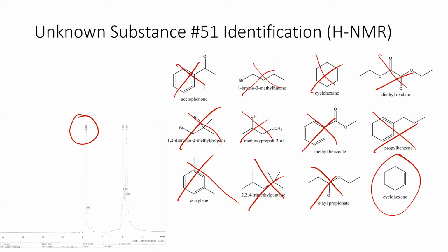The first chemical shift at 5.62 ppm corresponds to these two hydrogens. They are both bonded to an alkene, and there are 2 of them. The next peak at 1.9 ppm belongs to an allylic proton. These are protons next to alkene groups. This corresponds to the 2 protons on each of these sides, with a total number of 4.